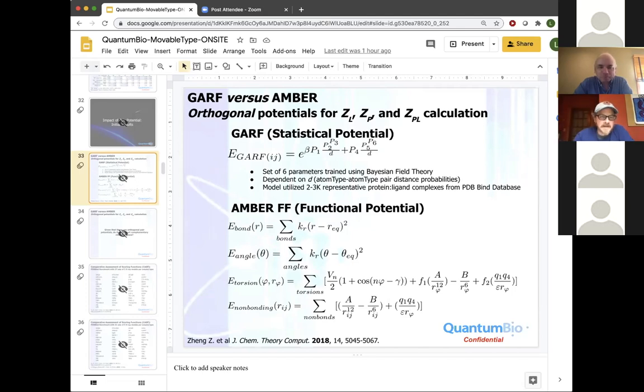They're producing these 3 angstrom maps, right? Like the poses are ambiguous in the structures in most cases, at least from my eyes, right? Like I can see that the ligand fits in the blob in a lot of different ways. Are people coming to you with cryo-EM maps and saying like, can we use your tools to help resolve the ambiguity in these cases? Well, yeah, I'll tell you, that's a good question.